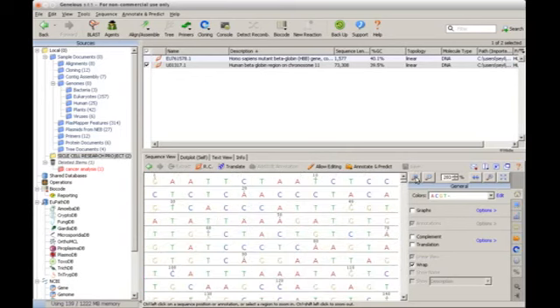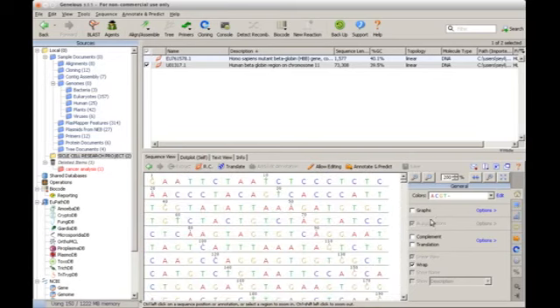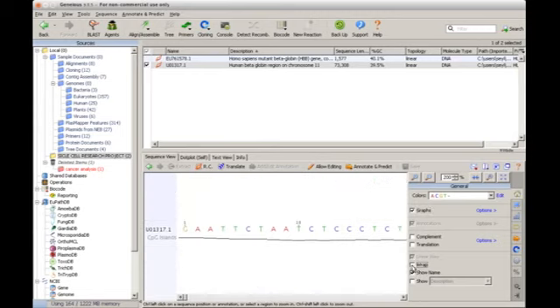As you can see, you can zoom, you can reduce, just like that. You can add the graph option on it, so we have all the graph here. In case you unwrap, you still have the graph this way. You can just move it, so you have all the sequence.